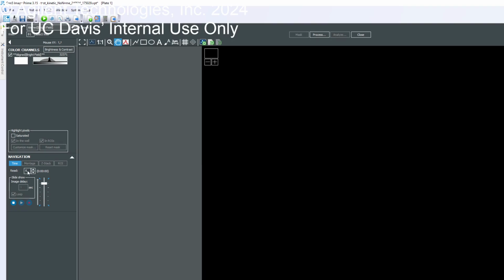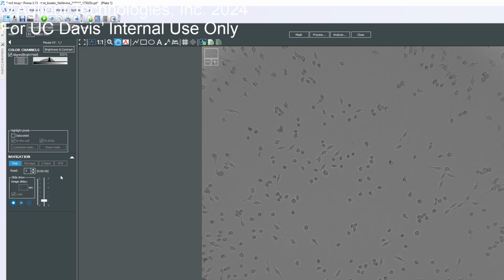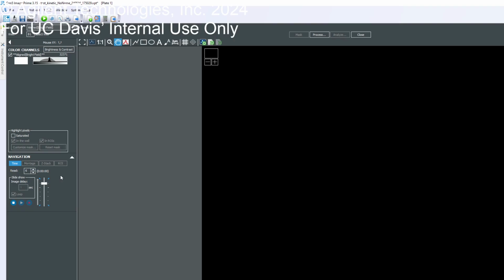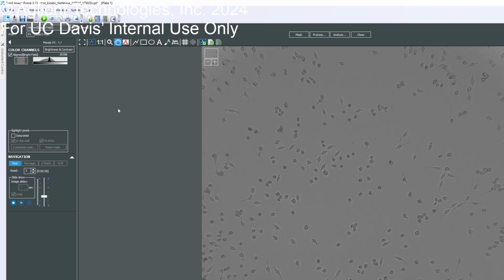Look at that, the top just got crumpled up. That's so sweet. Oh wait, that's only over a couple minutes? Just 2 minutes. Wow, they move pretty quick. They might be floating too. We don't know. We have to look at the calcein to see alignment there.